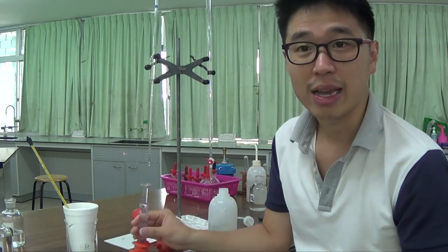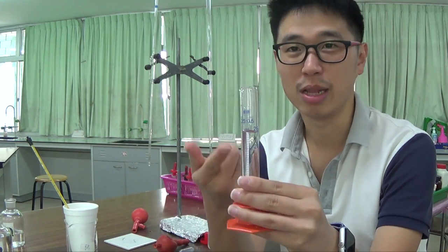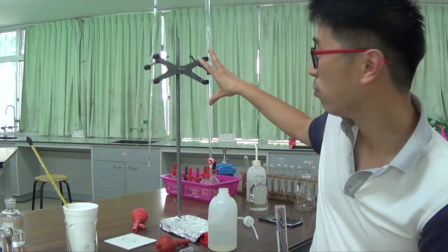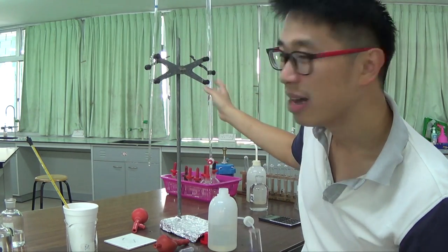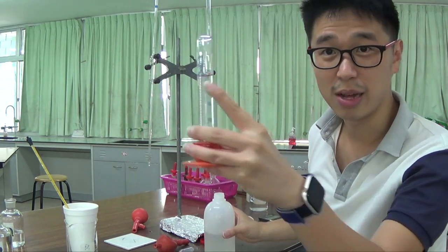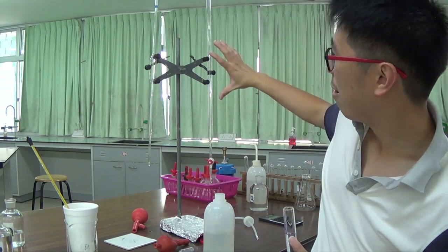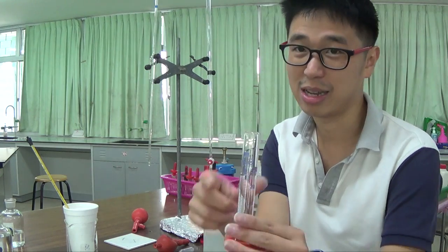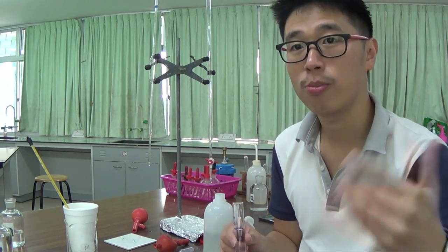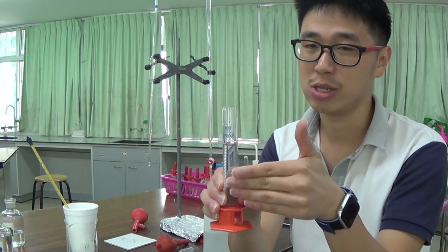Okay. What I'm saying is, again, this is a measuring cylinder. How accurate is a measuring cylinder compared to a volumetric flask or a burette reading? So why are we doing it in a measuring cylinder? I could have had two burettes. One burette for the Q, which was dilute sulfuric acid. Instead of doing this dilution in a measuring cylinder, I could have had another burette with distilled water, adding 5.00 cm³, then add 20.00 cm³ from the other burette, which would have been a lot more accurate than using a measuring cylinder. So these are the kind of improvements you can think about to improve the accuracy of this experiment, such as not using a measuring cylinder, and measuring the volume of distilled water using a burette.